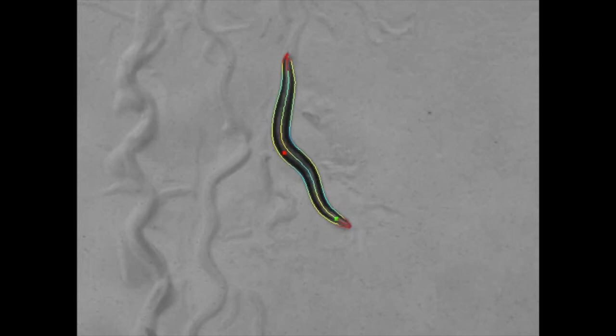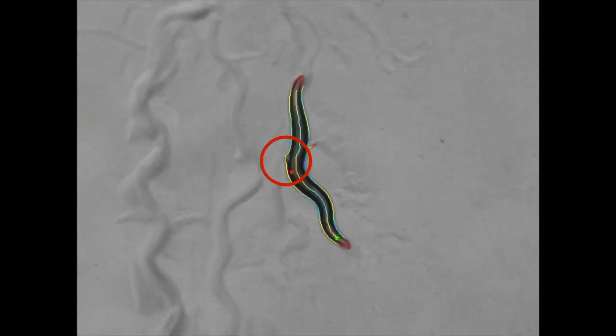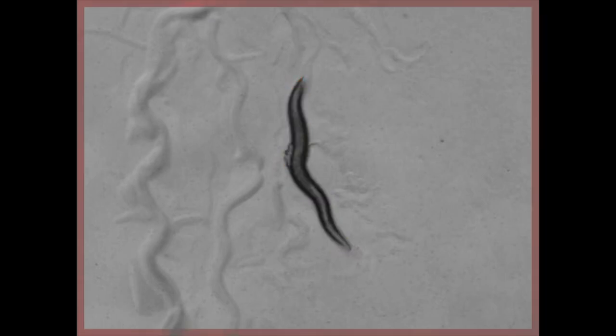So here is the first example of an unusual worm. On the right you can see a small worm approaching the large worm and as it hits the worm the egg is laid. This mutation in particular affects its motor control and this could possibly be linked to the egg laying behavior. So lots of eggs are being laid simultaneously.